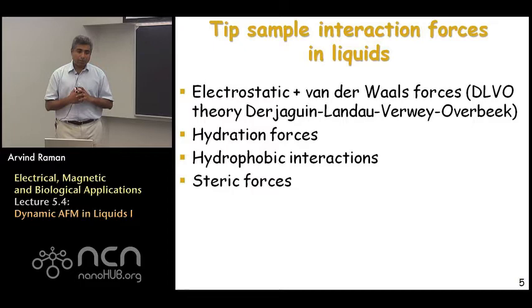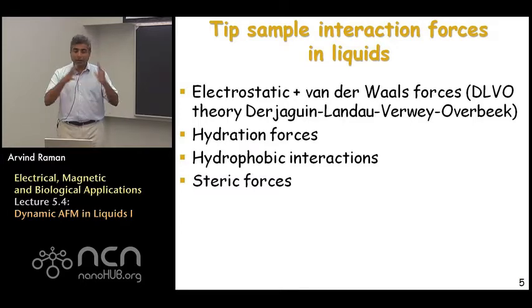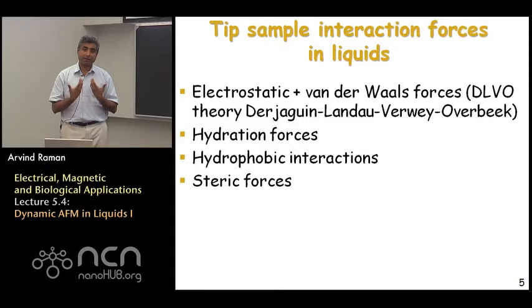Okay, so what happens when you take an AFM cantilever and put it into liquids? The first thing that I'd like to bring to your attention that changes is the nature of tip-sample interaction forces. In part one of the class, you talked about a variety of interaction forces which are applicable to air or vacuum situations, but you did not have a chance to consider what happens in liquid or aqueous saline solutions. So that's what we'll begin with in this particular lecture: to get an overview and understanding of the kinds of forces that exist in liquids.